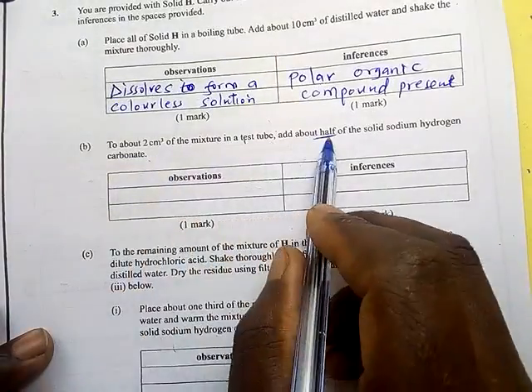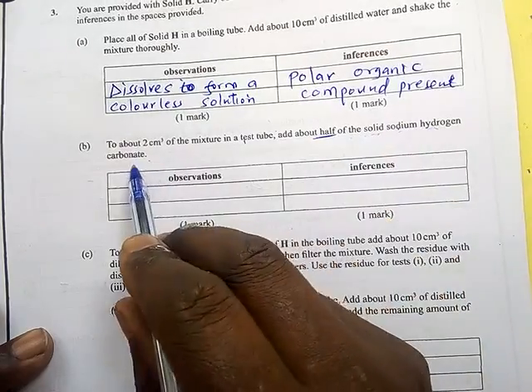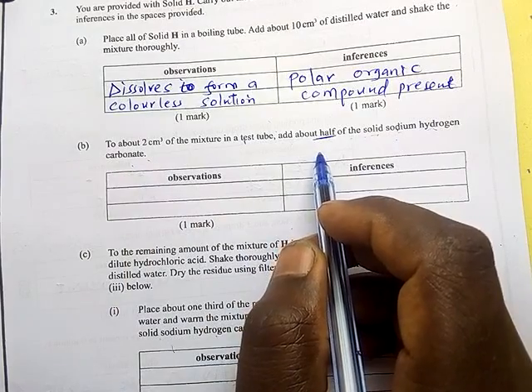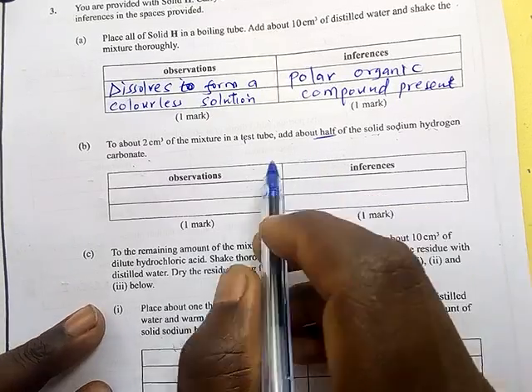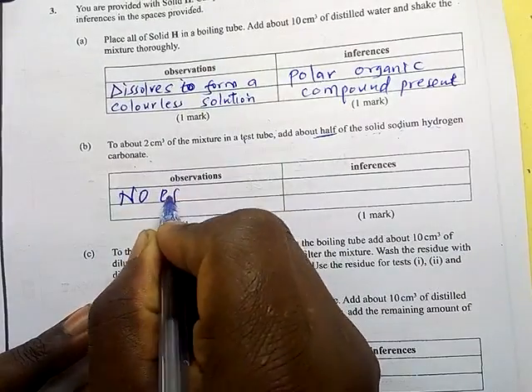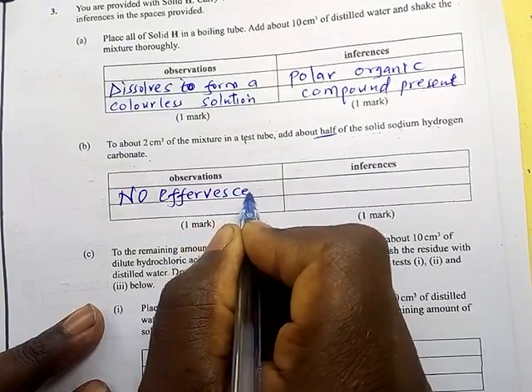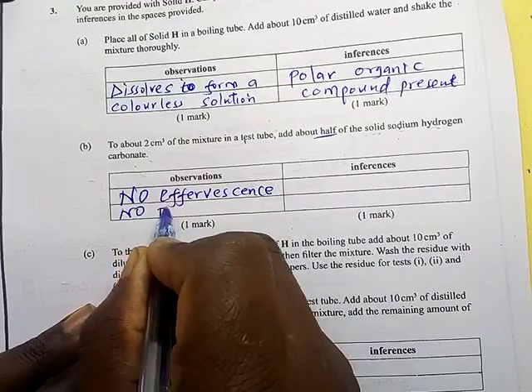Now, what we are adding is sodium hydrogen carbonate. Whenever we are adding sodium hydrogen carbonate or sodium carbonate, we are expecting effervescence. If the solution contained is an acid, then we will receive effervescence. So for this one, there was no effervescence, or there is no fizzing.